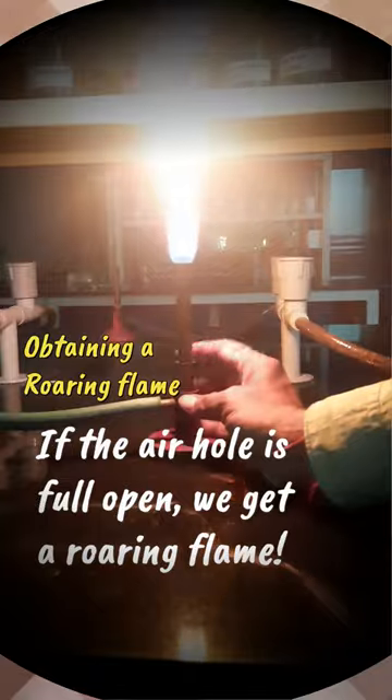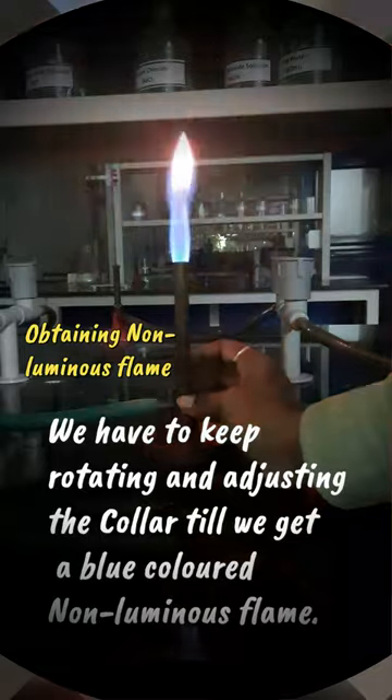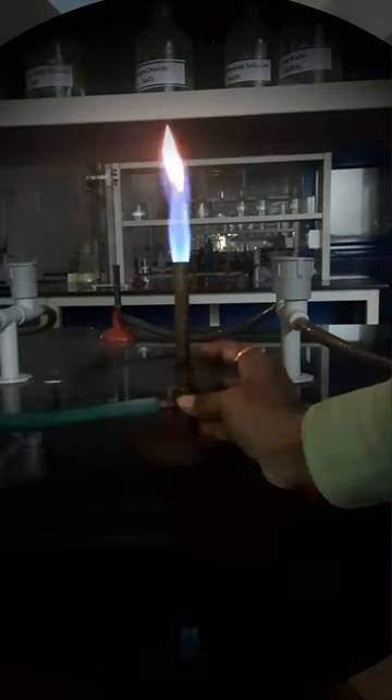If the air hole is fully open, we get a roaring flame. We have to keep rotating and adjusting the collar until we get a blue colored non-luminous flame.